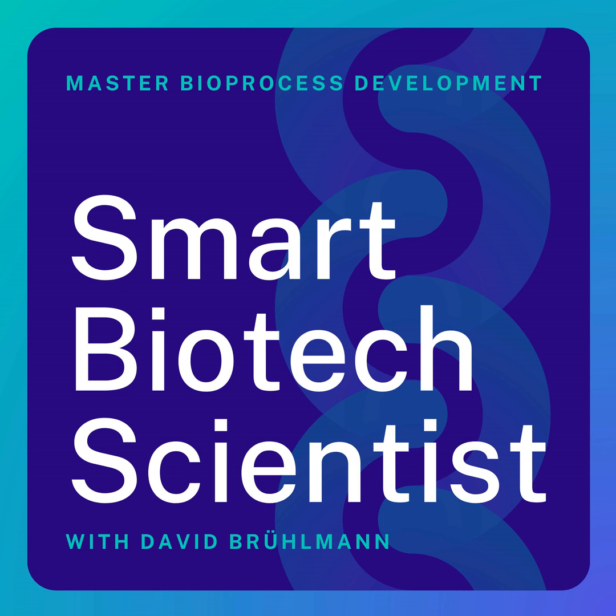Hey, smart biotech scientists. Welcome to part 2 of our conversation with Payar Radfar, who's the co-founder and CEO of Smart MCs. It's a startup dedicated to creating microcarriers and smart biomaterials for large-scale cellular therapy, cellular agriculture, and vaccine production. If you haven't listened to part 1, go back, because that's where we talk about why you should be considering using adherent cell cultures and microcarriers in the 21st century, the benefits of that, and the particular challenges when scaling up such a cell culture.